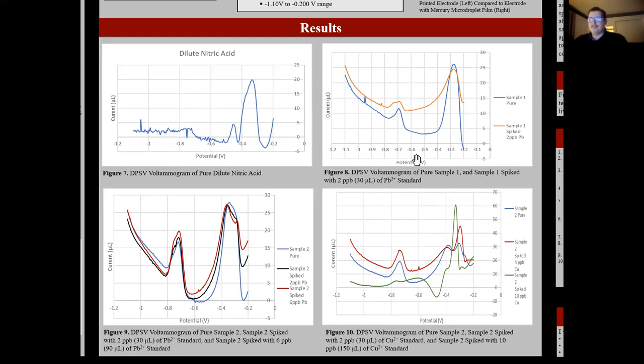In figure eight, you can see a voltammogram of sample one spiked with approximately two parts per billion, 30 microliters of one ppm lead standard. You can see here that the peak at negative 0.7 is a little bit higher on the graph, and that indicates that there was a larger reading of current, which is how you measure for concentration.